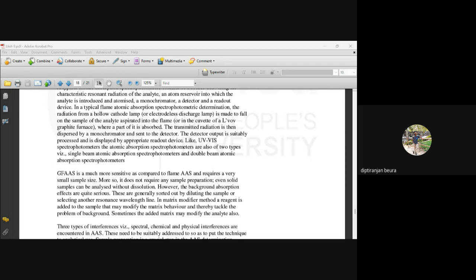Okay, ma'am. It will select a particular wavelength. Yes. We are not going into that detail in class because it is not in your course. I have many monochromators and many filters with me, and depending on our selectivity, we can select. So it depends on the nature of the analyte. The way you use the radiation source depends on the nature of the analyte, and here also you can select the monochromator. The monochromator then focuses the radiation to the detector, and we show the absorbance versus concentration plot.